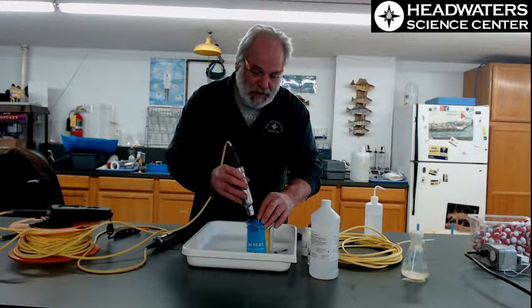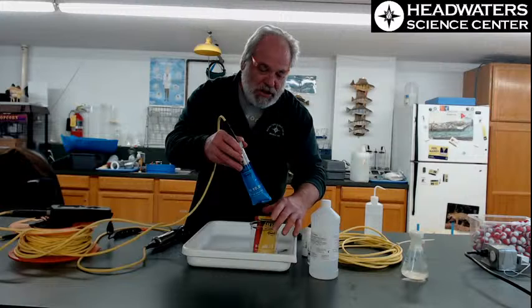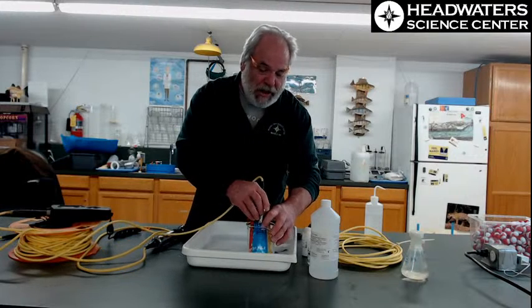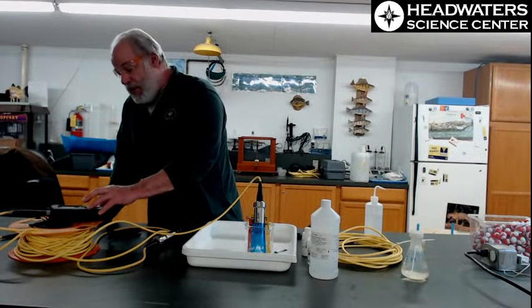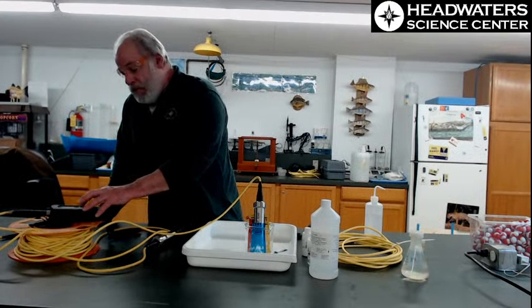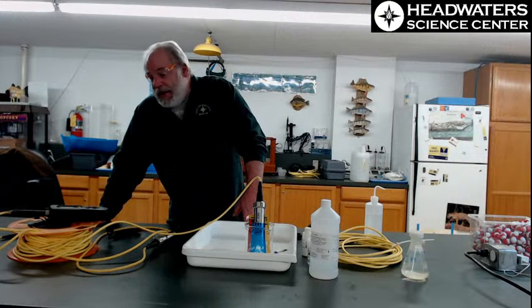Let's put it back in there. Shake it off. Let's get it down in there. So there's a little bit of solution down at the bottom of each one of these packets, and again, they're made easy for the field. So let's store the last one. And we're predicting a 10. I'm already to 9.97, settling in at 9.99, 10.